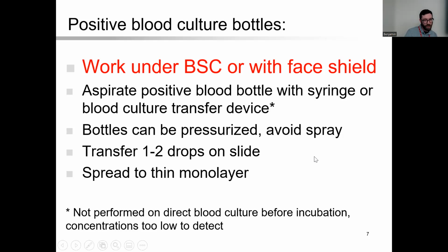Blood cultures, they can be a very thick specimen. So you do want to try to really spread that out. And then your anaerobic bottle can wash away pretty easily. So it might need a couple extra minutes of setup time.